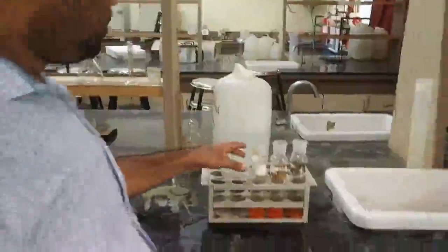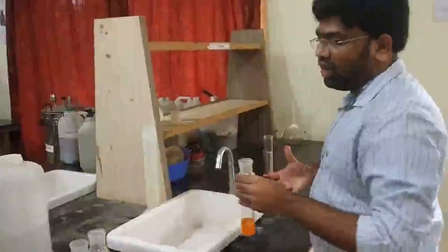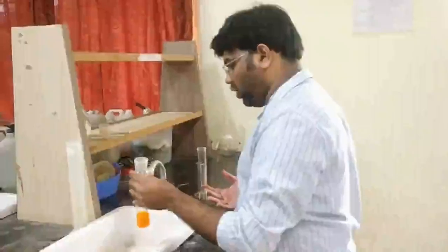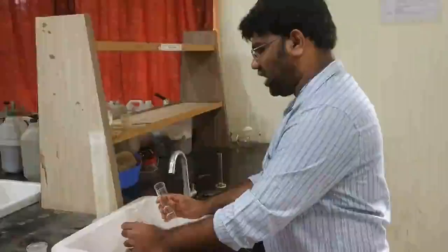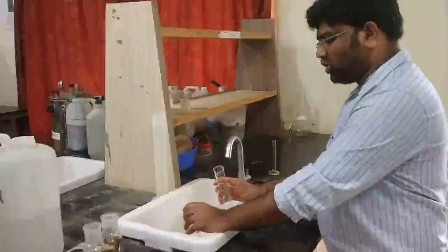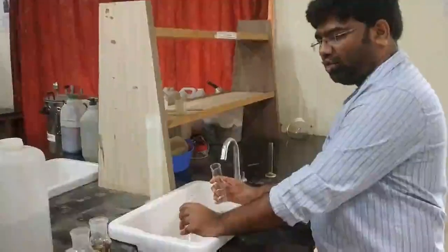There is no stepwise addition; a slow addition of H2SO4 is to be done. Otherwise, the sample may fail, because shock loading of the acid is not recommended here. Same thing, you have to hold your digestion flask away from your face, so that even if there is a bumping action and the acid is thrown outside, it won't harm your face.